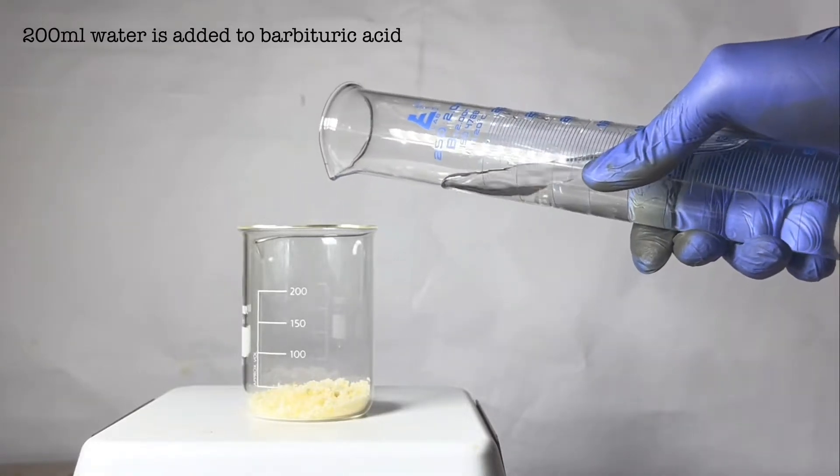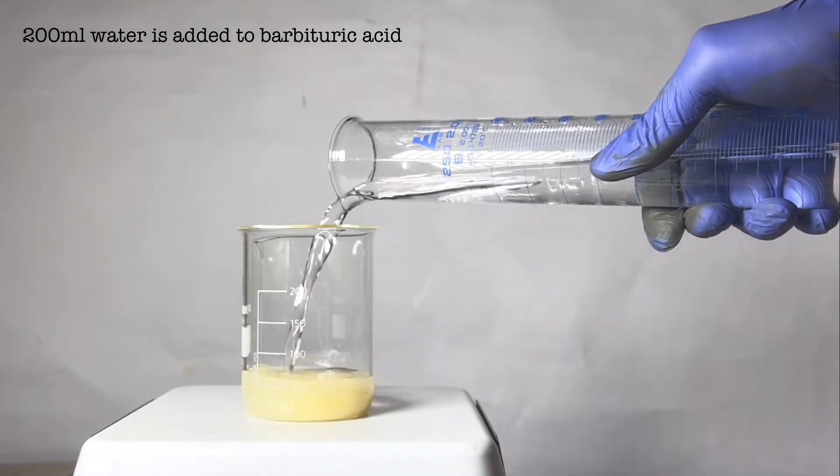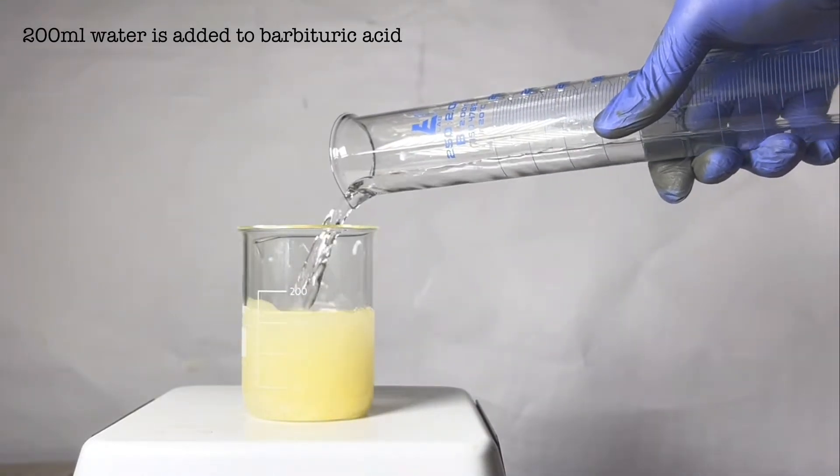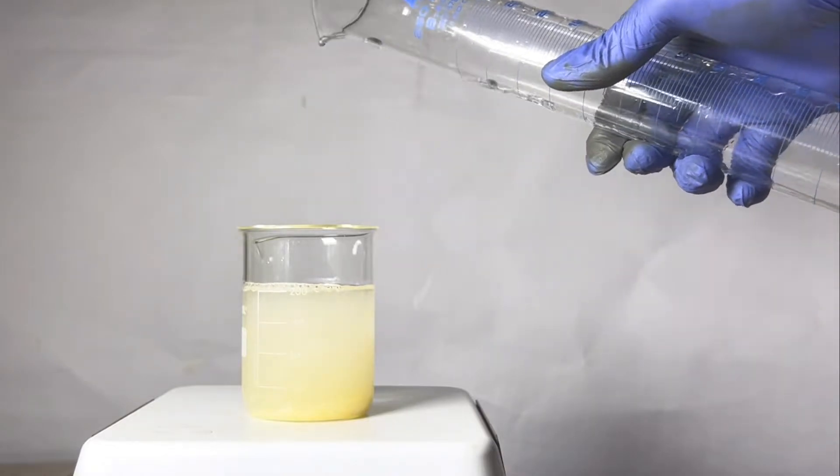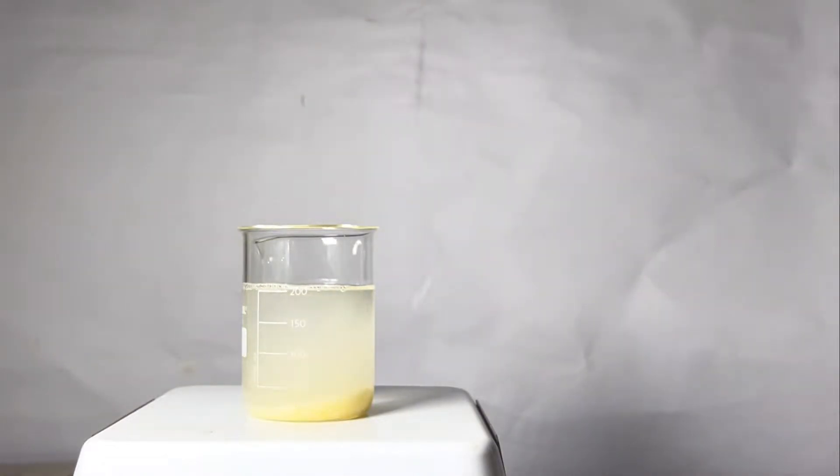200 ml of water was added to the beaker. Barbituric acid has decently high solubility in water, so it easily dissolves. After a few minutes of continuous stirring and gentle heating, we are left with a clear pale yellow solution.